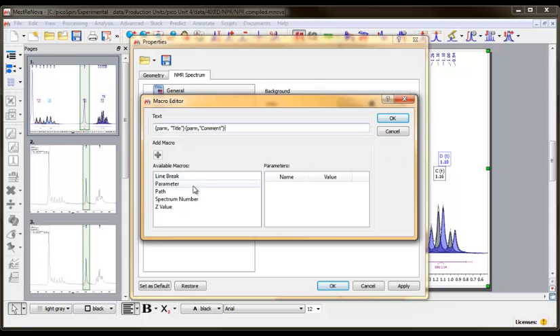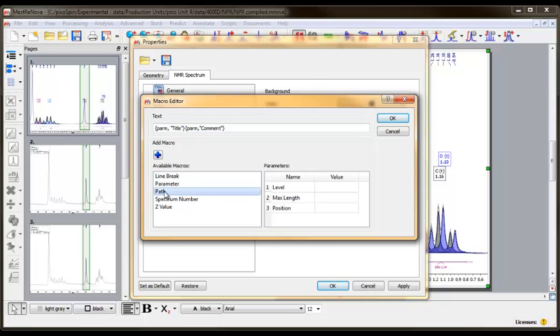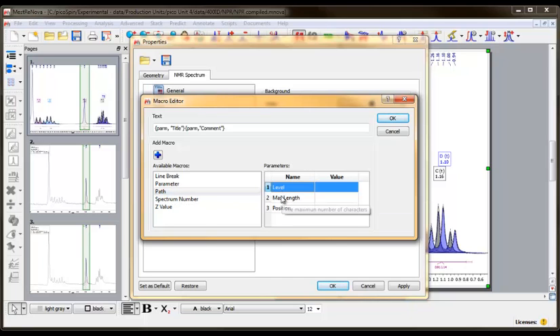Navigate to the Path macro and click it. You can learn more about the parameters by hovering the cursor over them. For example, if you want to see only the file name for the dataset, then change the level value to 1.